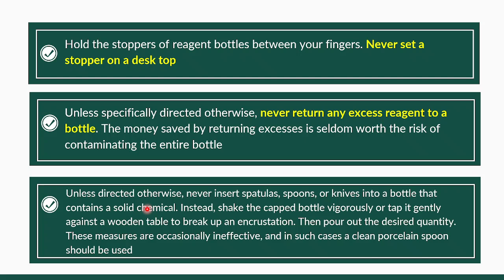Okay. We have experienced this one kasi. We have an experience in which ang chemicals nga among gigamit kay ni bantok na siya, ni gahi. So, dili pwede nga amo tong pangdukdukon sa spatula, sa knives, kay basin makontaminate pod.